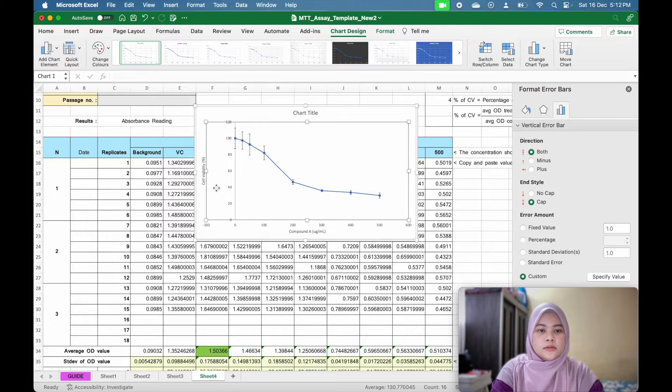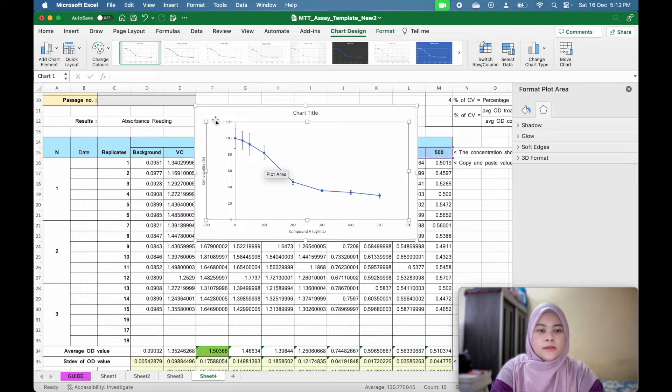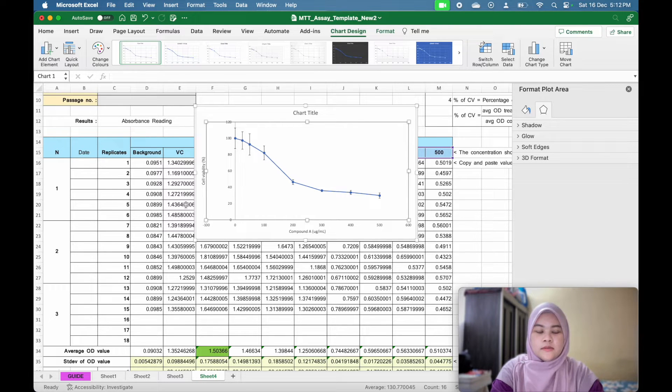So now you have the error bar. And that's the first step. Second step is you want to find your IC50.